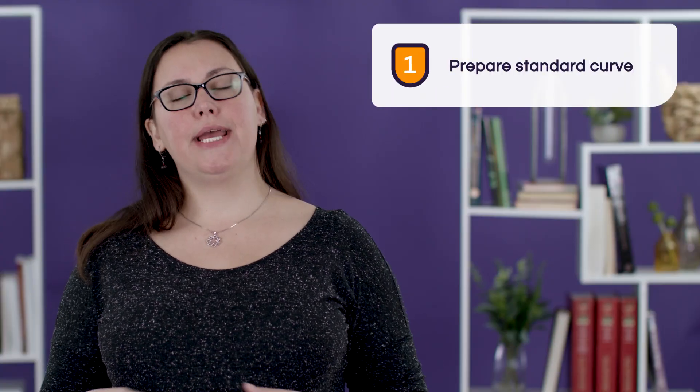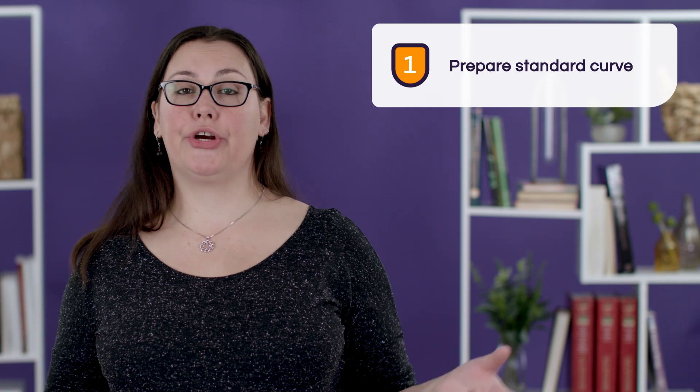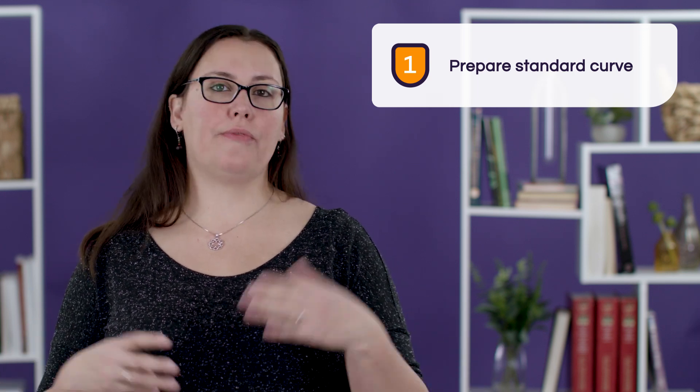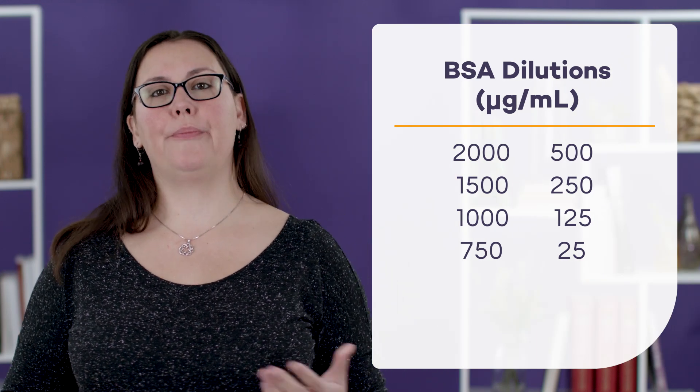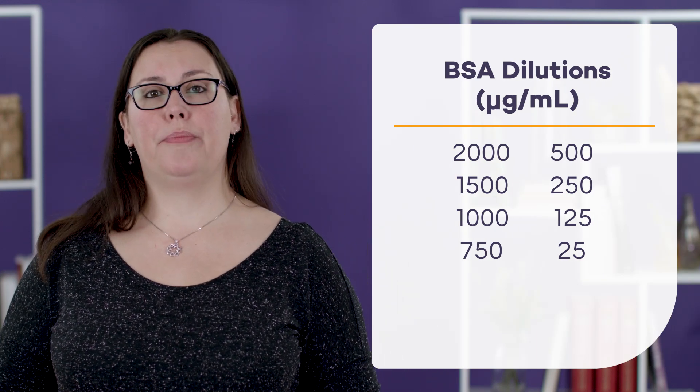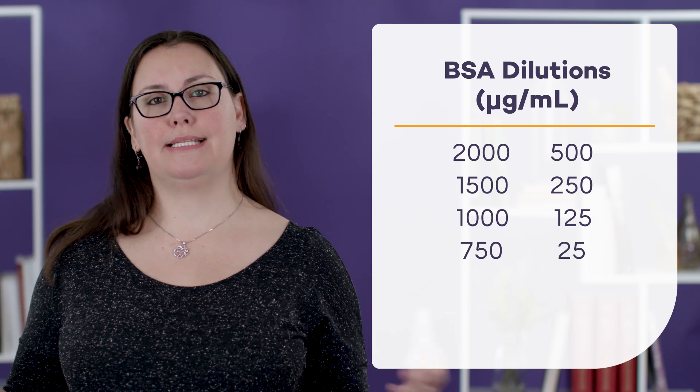Now that we've gathered all of the reagents and instrumentation that we need for the BCA assay, we're ready to get started. The first thing we're going to do is prepare our standard curve. In our case, we're following the Thermo protocol and their datasheet. We're simply going to use BSA, starting from their stock solution at 2,000 micrograms per milliliter, and we're going to prepare 8 dilutions for that standard curve.